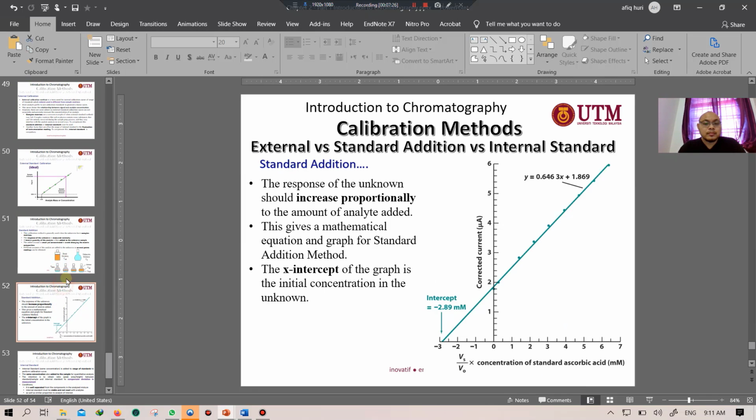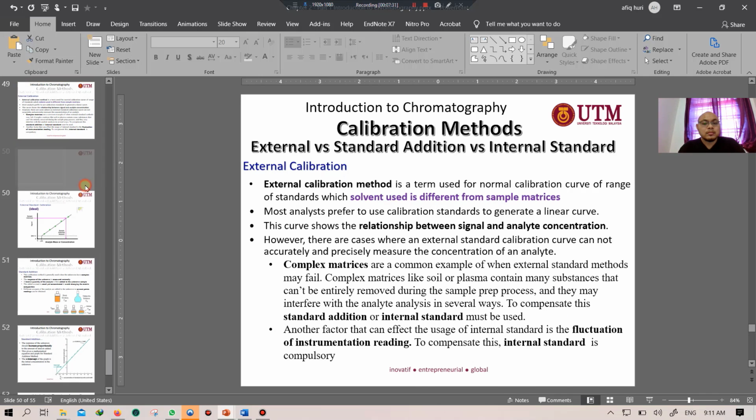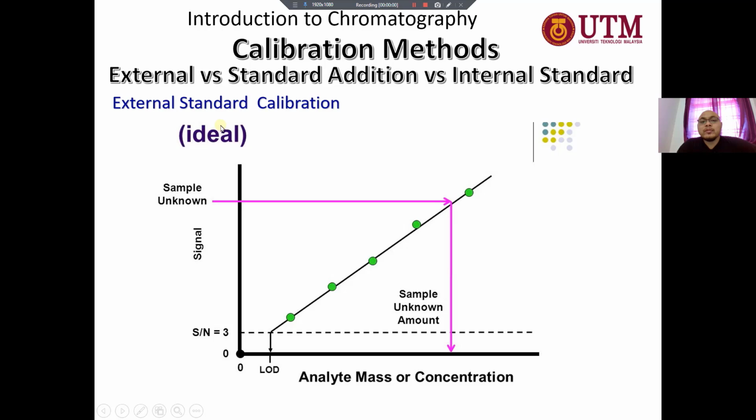Let me have some drawing. Before we go further into the standard addition and internal standard to compensate for our issues, let's take a look at the external standard calibration ideal graph. Here is the external calibration graph, where we make a graph of signal versus concentration of analytes.